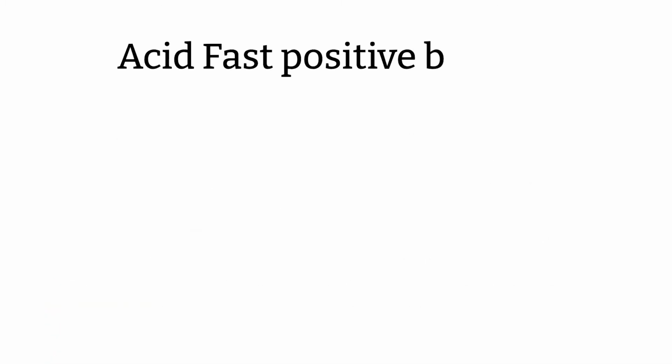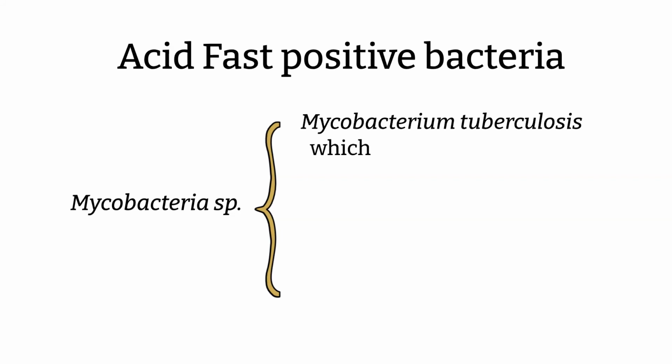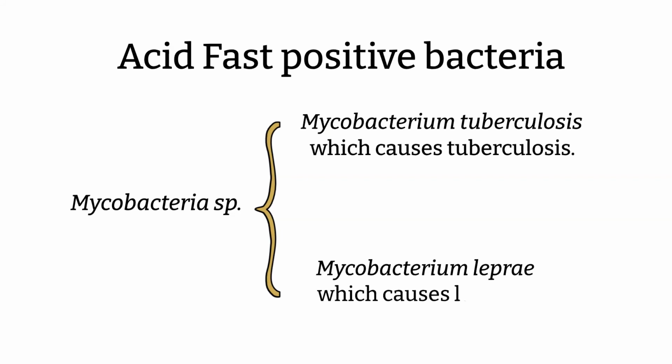A common pathogen that uses this type of stain to help identify is in the species of Mycobacteria. For instance, Mycobacterium tuberculosis, which causes tuberculosis, and Mycobacterium leprae, which causes leprosy.